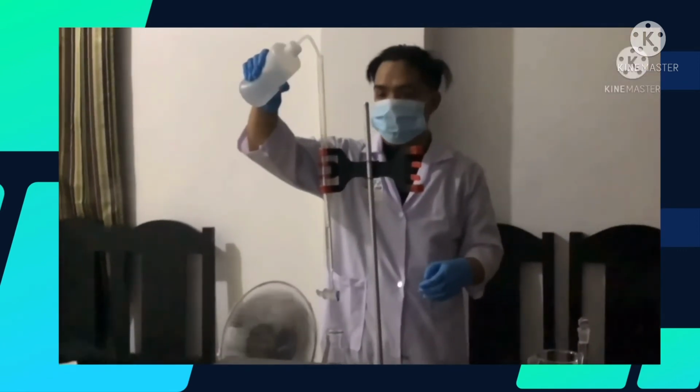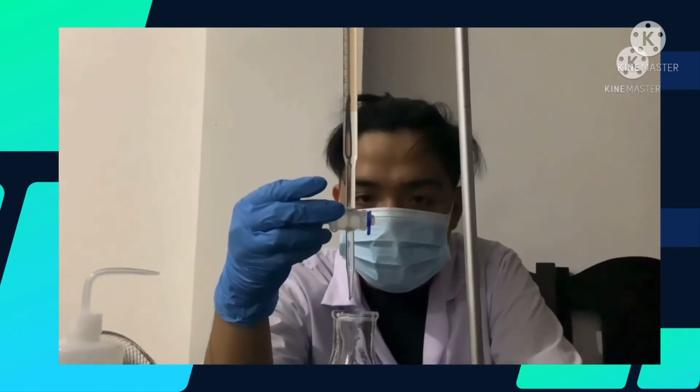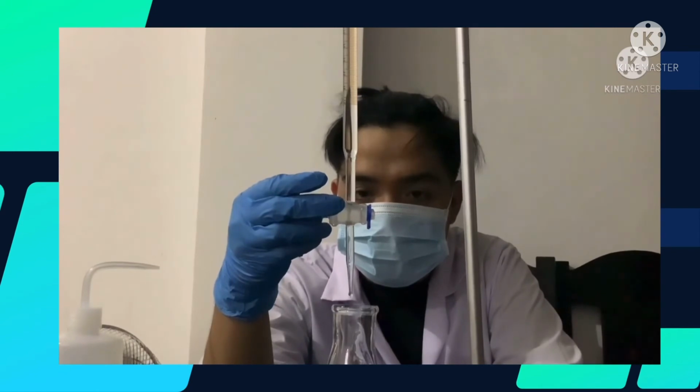Refill the burette and take a new zero reading. Add 30 drops to the Erlenmeyer flask and take the final reading. Calculate the mean volume of one drop. Repeat this using 40 drops and again calculate the mean volume of a drop using half drops.